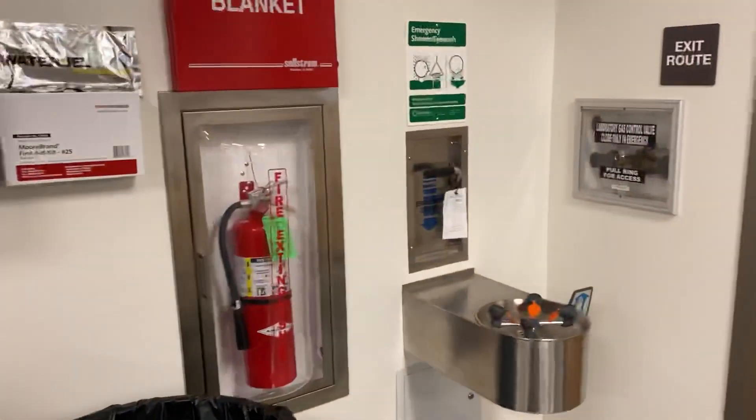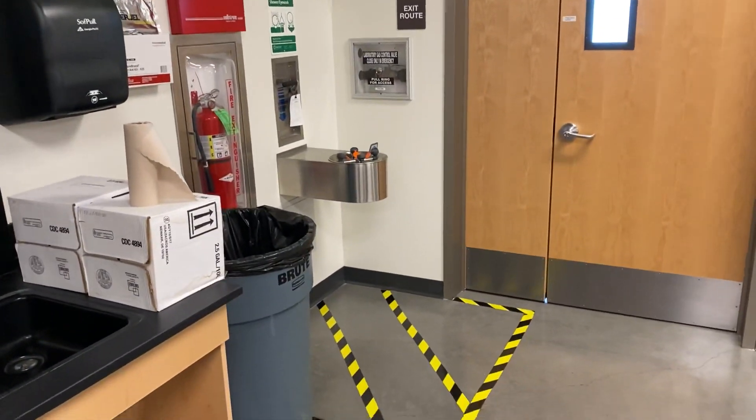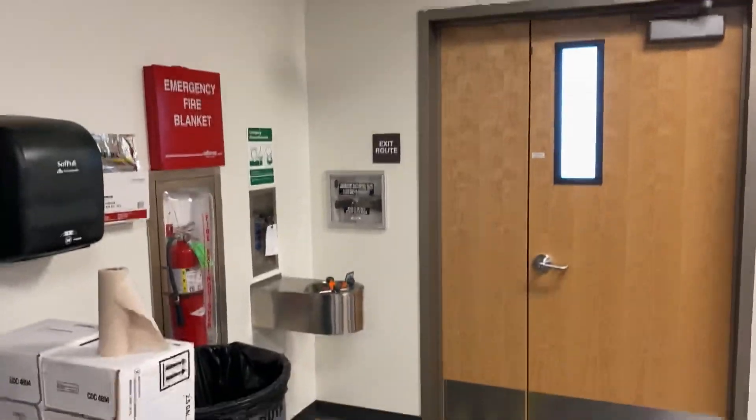Paper towels, and also any emergency measures — our fire extinguisher, our shower, and our eyewash.